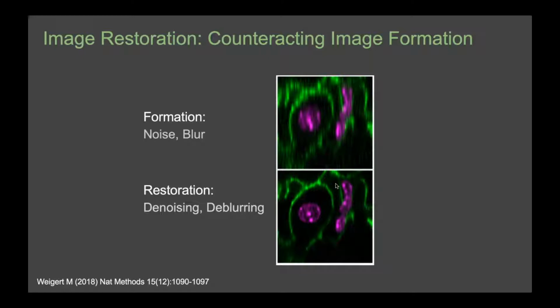Traditional algorithms for denoising are probably just averaging filters. I will talk about that in a second. And for deblurring, you might have heard of deconvolution. That's the classical thing that people do. In fact, the example I was showing here on the screen is not doing this. They use some more modern approach, as you have heard of all the deep learning. So they used a deep learning algorithm to denoise and deblur in one go, and get, in this case, I think, a good looking result.